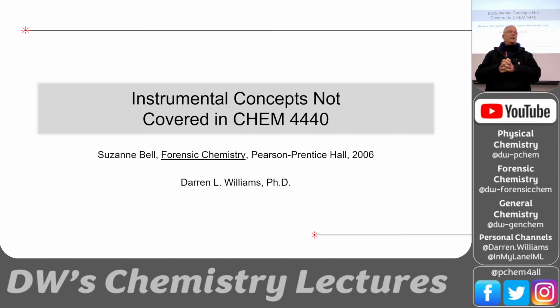A lot of times the acronym ESCA is not used, but it's a similar thing to what we do on electron microscopes, where we have wavelength dispersive spectroscopy or energy dispersive spectroscopy. So we'll get into those other things that are used not just in forensics, but also in a lot of material science labs. So scanning electron microscopy is a very, very good technique for trace analysis.